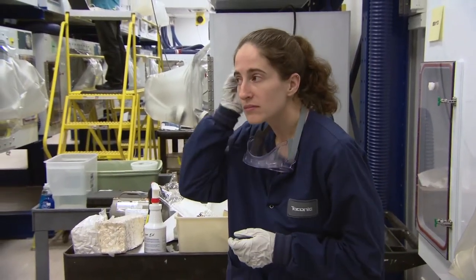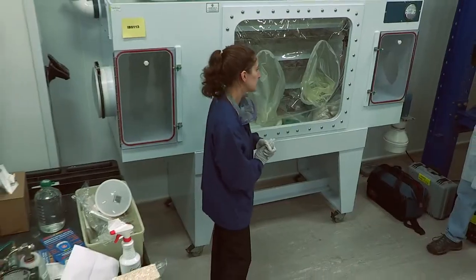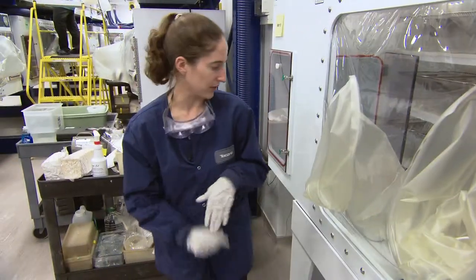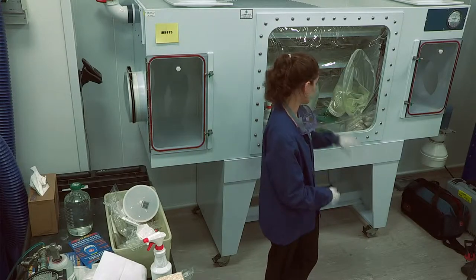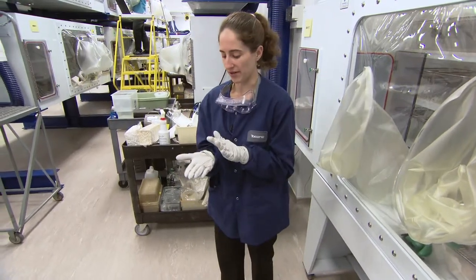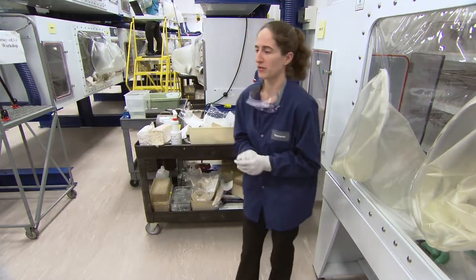With the germ-free shipper, it would go in at the end and then transport those animals into those cages. Are you using an additional glove set when handling the rats to protect those gloves? If we had animals in here, we have a canvas glove that gets autoclaved that they'll wear on top of the isolator glove to help protect from bites. We also use forceps for the mice. So whenever we're working in an isolator, we need to have long sleeves and a pair of nitrile or latex gloves on to reduce skin cells. We also have cotton glove liners available for those sensitive to the gloves or with perspiration.